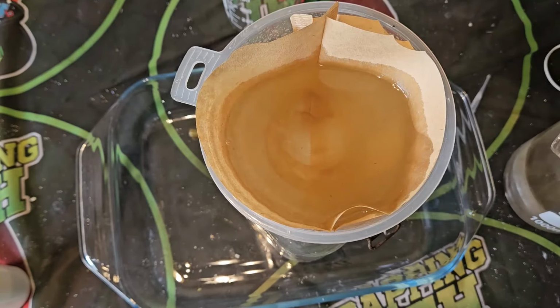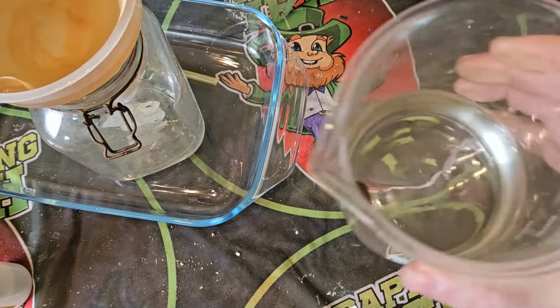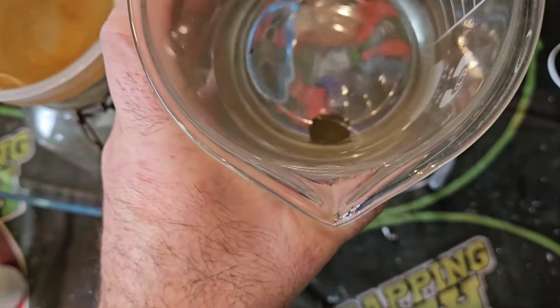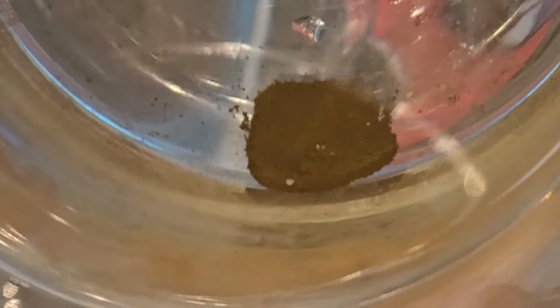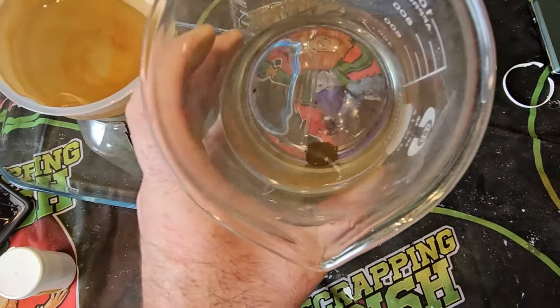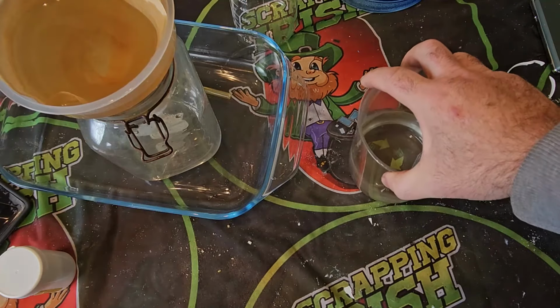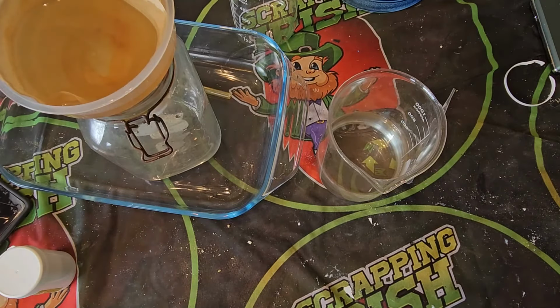So let me just push this to a side for a second so you can actually see. Down in the bottom, if I zoom in, there is our gold powder. Now, it's not 100% refined or 100% cleaned yet, but it's very close to it. So we're going to let this filtering carry on and come back when I'm finished filtering, and we'll see what we've got when we've dried it out and weighed it. So let's see how we got on.